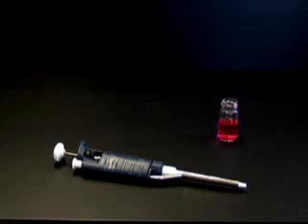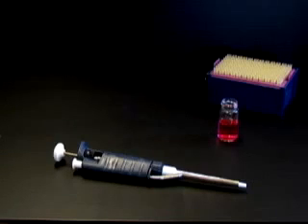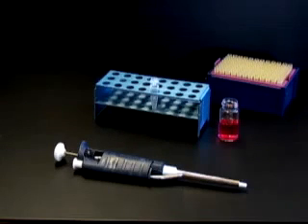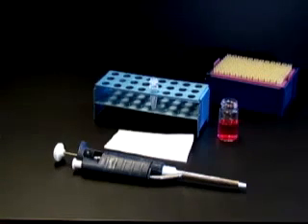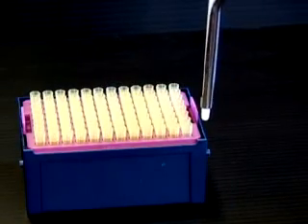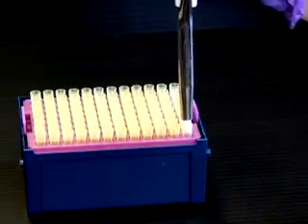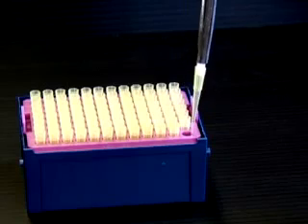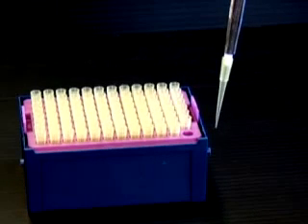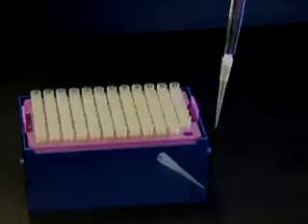Now it's time to transfer your sample. You will need your appropriately sized Pipetman set to the desired volume, the correctly sized tips, a rack, the new container, a Kimwipe, and a waste container. Attach a disposable tip to the Pipetman by pressing its plastic shaft firmly into the tip with a twisting motion. This action should ensure an airtight seal and prevent leaks from occurring.